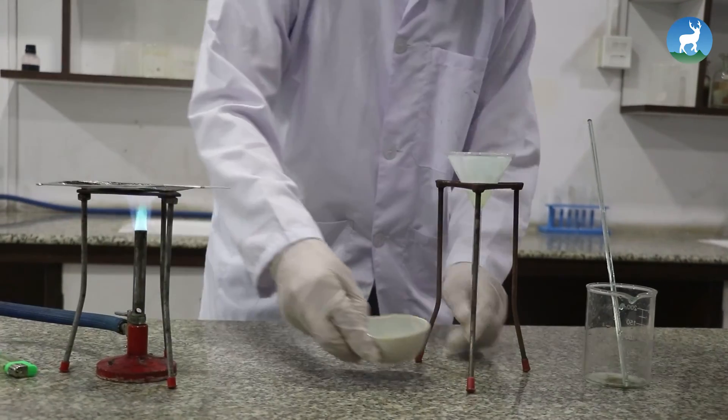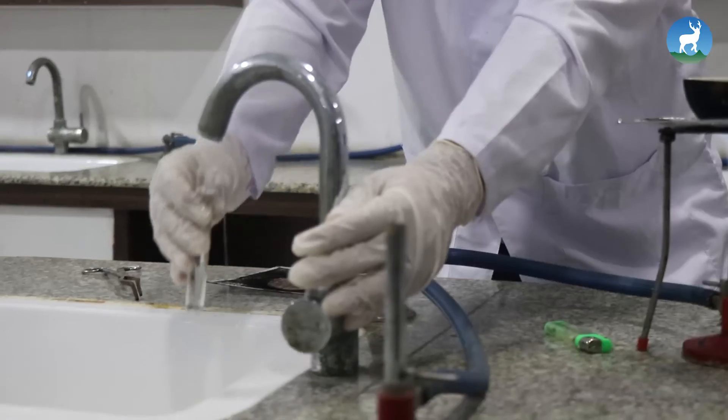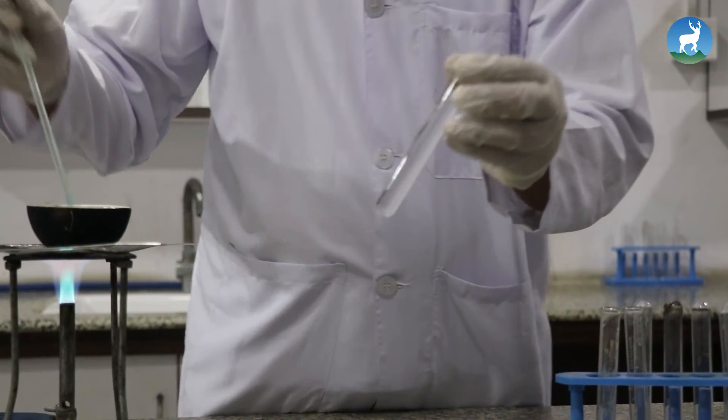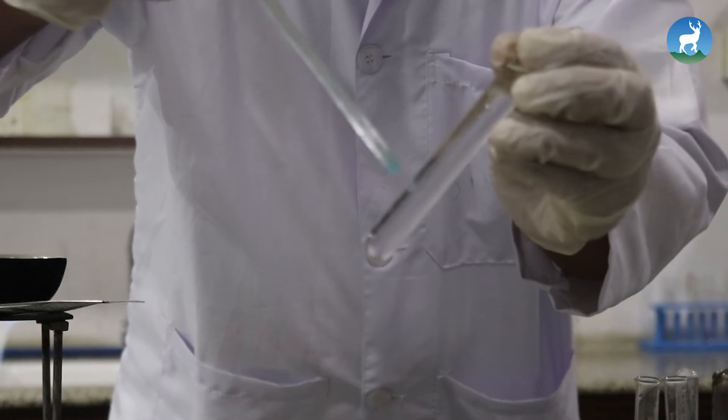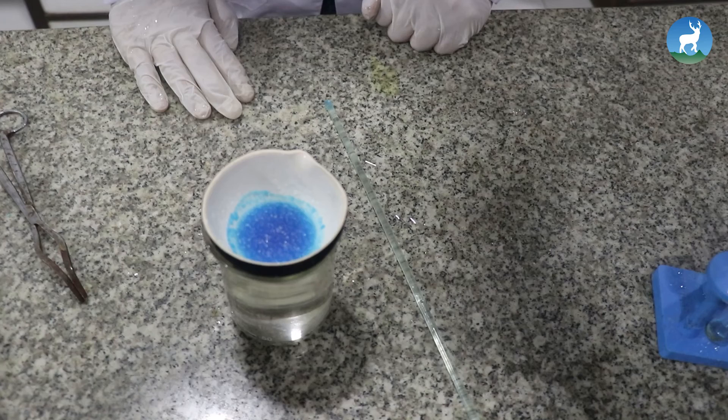Evaporate the filtrate taken in the basin for some time. The crystallization point is checked by putting a drop of boiling solution from the basin on the outer wall of a test tube containing cold water. Appearance of mini crystals instantly indicates the crystallization point has been reached.